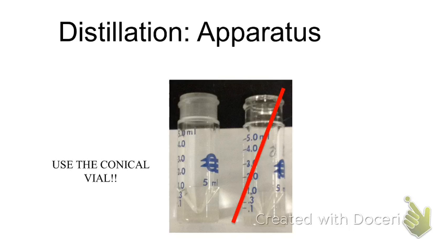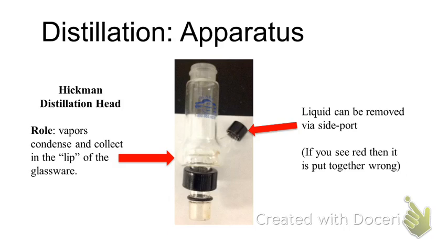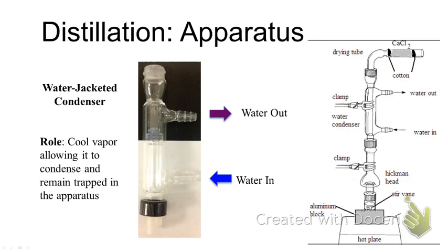Okay? So please don't use the storage vial. Use your reaction vial when starting this experiment.